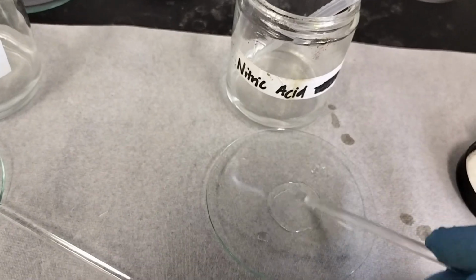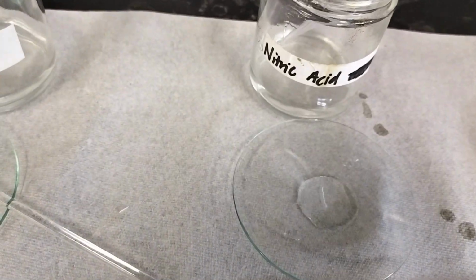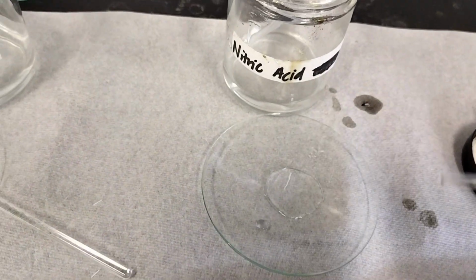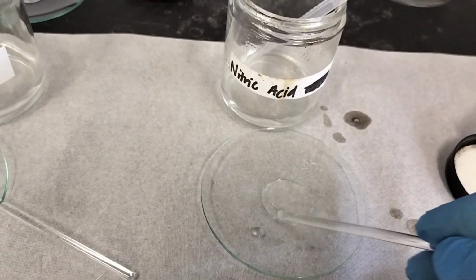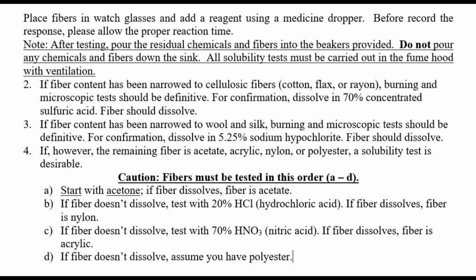because the fiber did not dissolve in acetone, hydrochloric acid, or nitric acid. According to our instruction, we can conclude that the sample is polyester fiber.